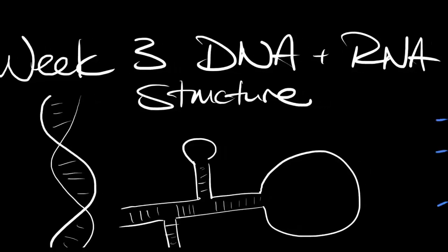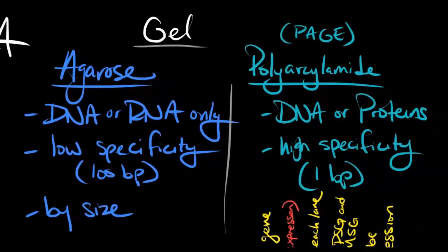So first off, gels. In this class, we focus primarily on two types of gel. Now, when we say the word gel, we're usually referring to gel electrophoresis. Don't get this confused with gel chromatography. Really, the only time bigger things travel faster are with gel chromatography. Otherwise, when we talk about gels, think bands traveling through the gel at different speeds, with smaller things going faster.